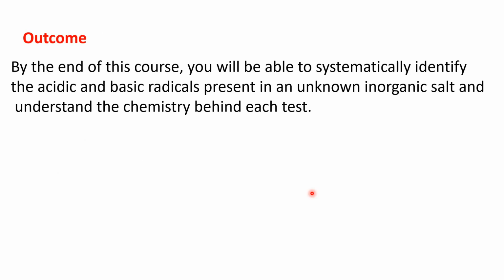Now what is the outcome? At the end of this course, you will be able to systematically detect the acidic and basic radicals present in an unknown inorganic salt and understand the chemistry behind it. That means understand the type of reaction, the chemical equation, the specific chemical reactions with equations.